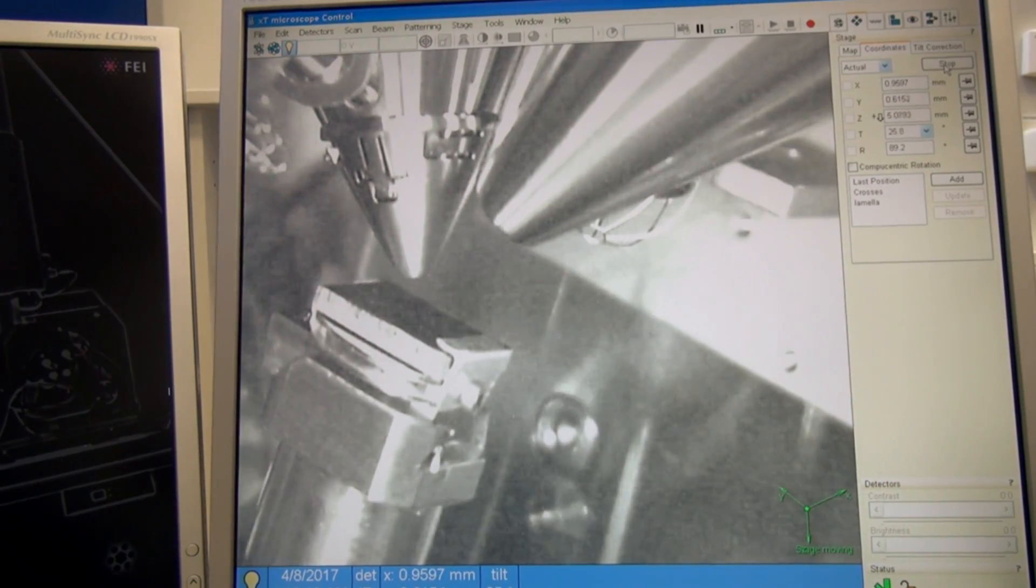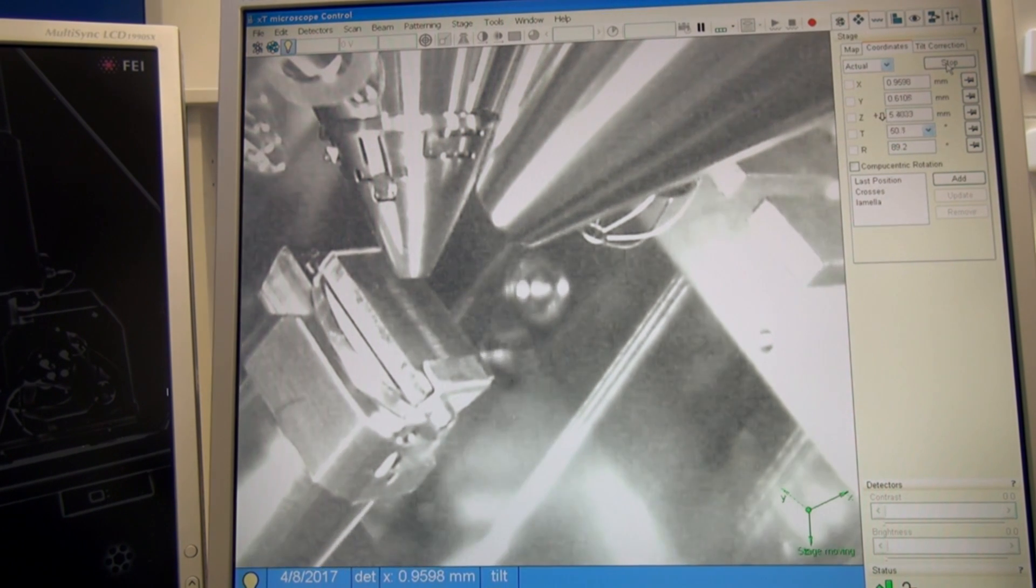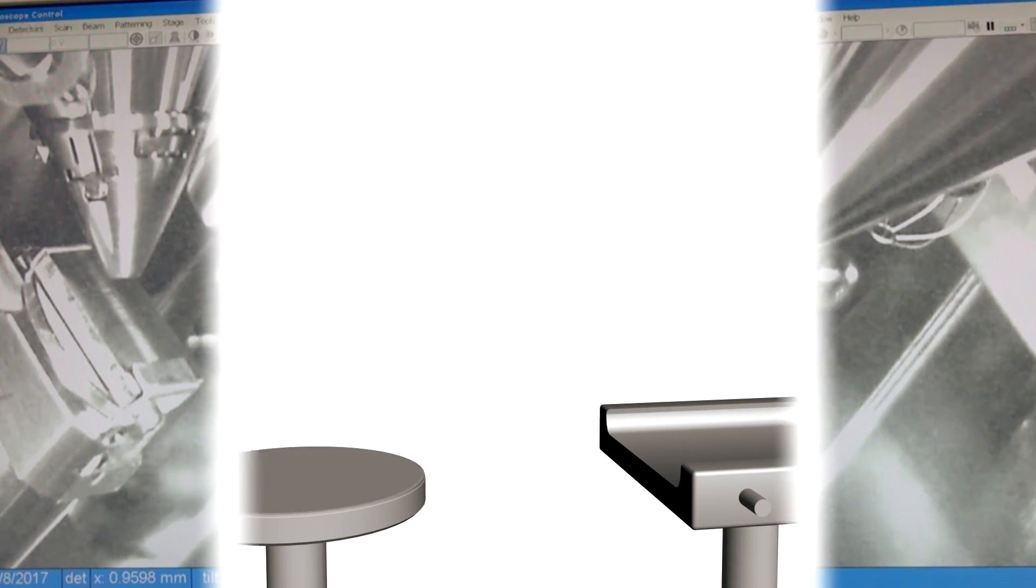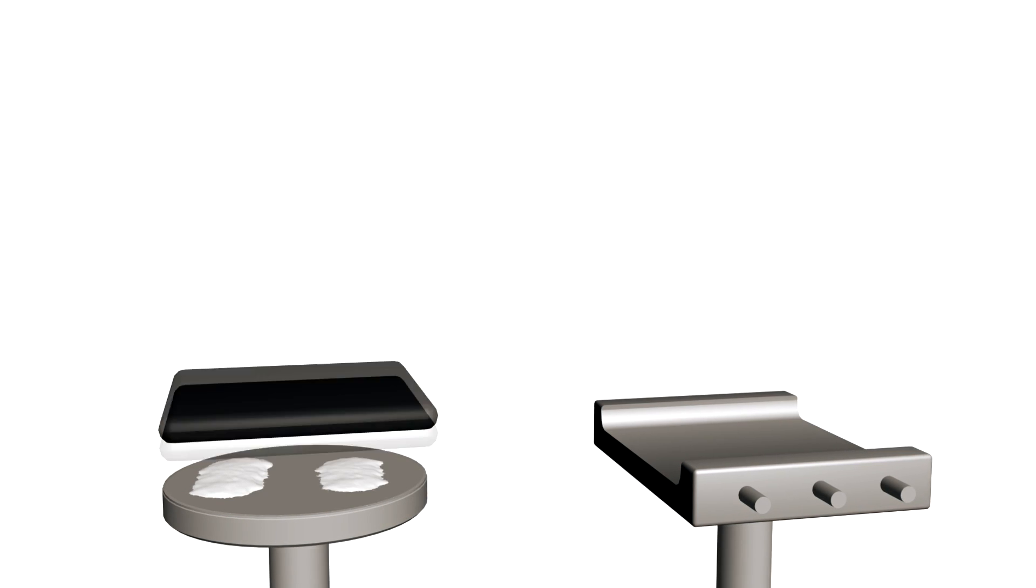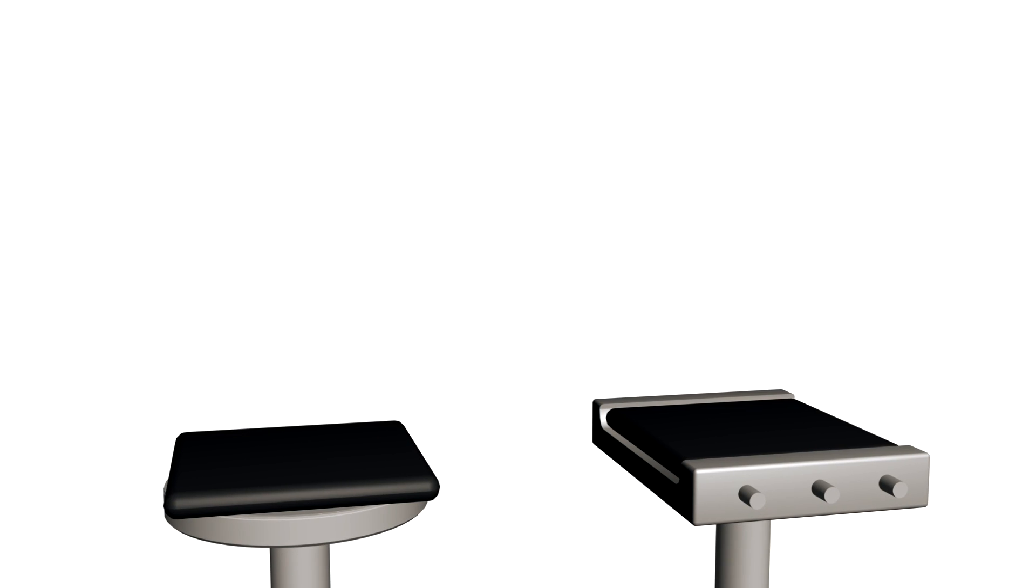In order to use the ion gun, the studied substrate needs to be tilted. Therefore, the sample must be firmly attached to the holder. This can be achieved with the help of a silver paste or mechanical holders.